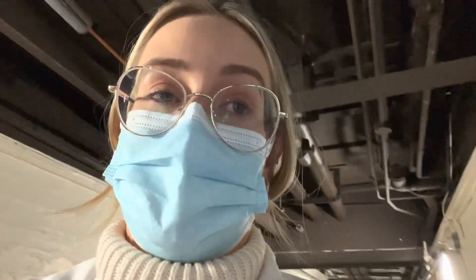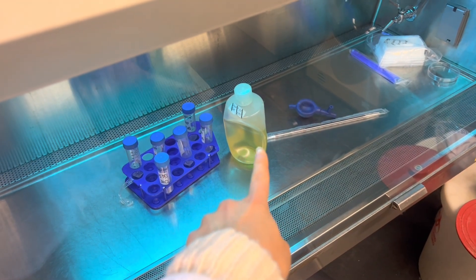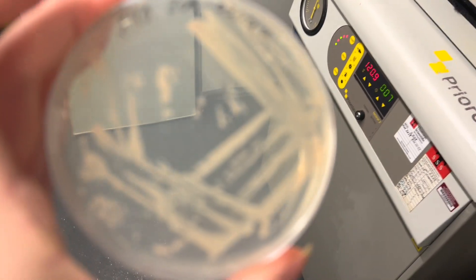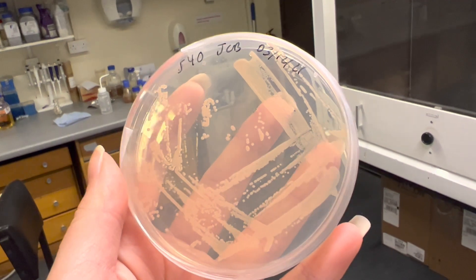In the meantime, I'm going to put my bacteria into liquid media to make overnight cultures for the bioassay tomorrow. Excuse the noise of the shaker, but here's all my stuff. I'm going to be putting the liquid media into the falcon tubes and then transferring my bacteria into the liquid media to grow liquid cultures.